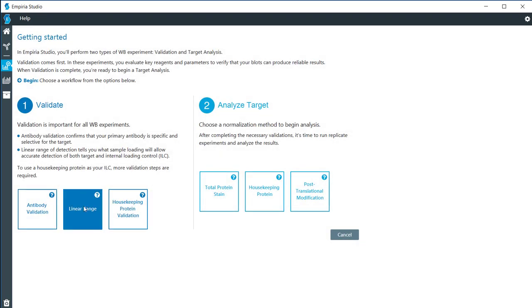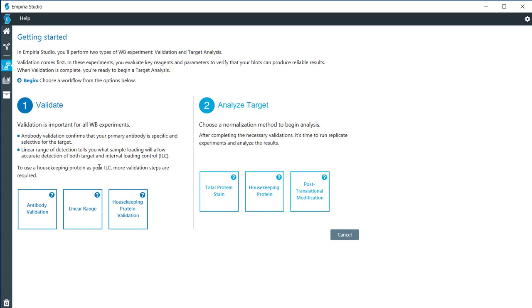Down here we have the linear range and the reason that we need to validate the linear range is so that you can confirm that the amount of protein that you've loaded can actually be quantified efficiently by the software. This includes both whether it is a housekeeping protein, the revert total membrane stain, in addition to the target that you'll be using.